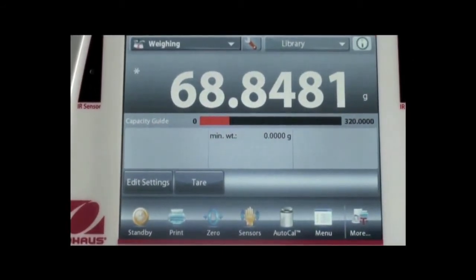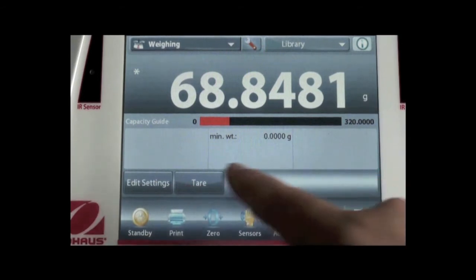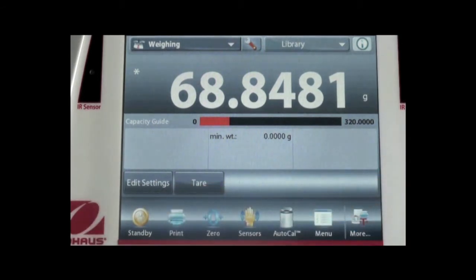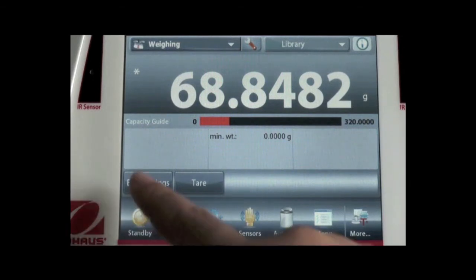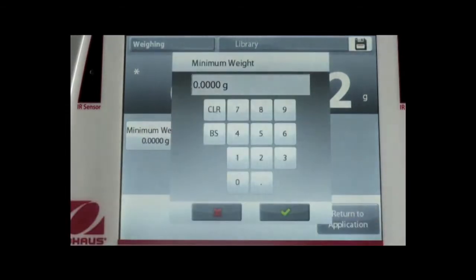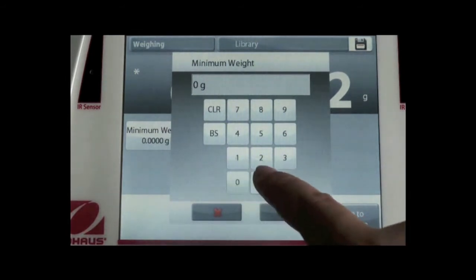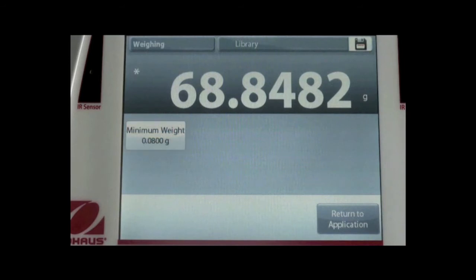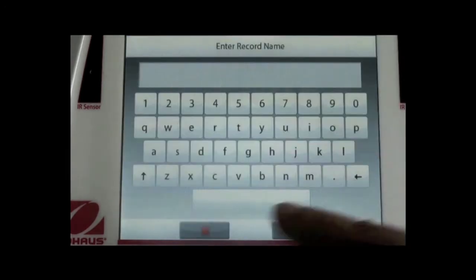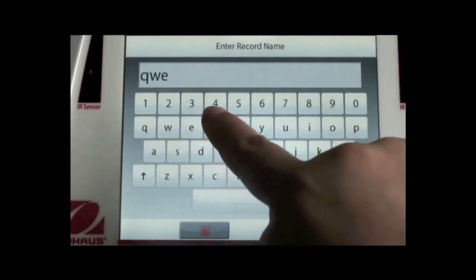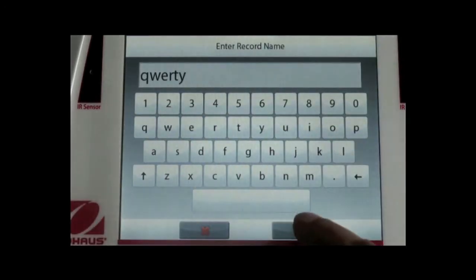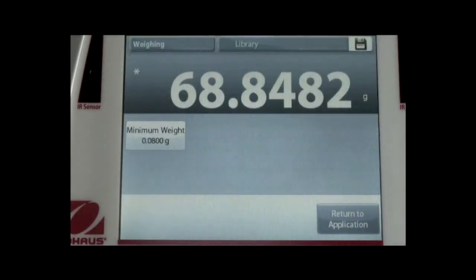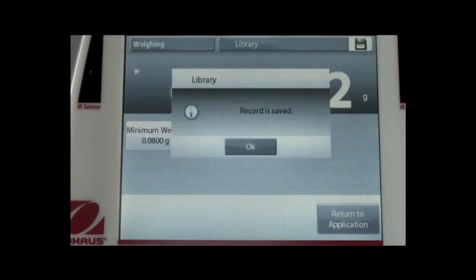The fourth line is the submenu setting area. It allows you to set up specific parameters according to your sample on hand. For example, I can set the minimum weight value by touching the button via numerical keys. I can save the value to the library using the keyboard, just like you use for a PC. Up to 99 items can be stored.